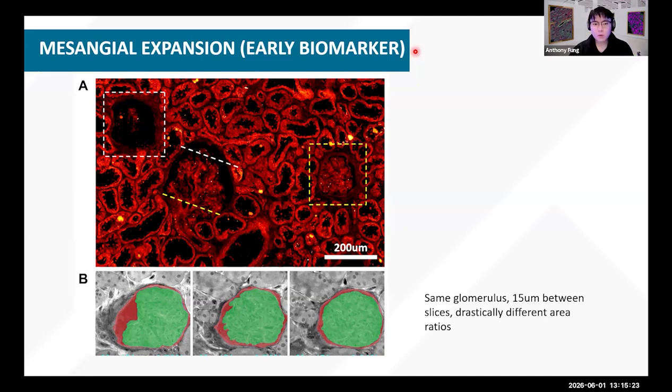But this can be done really quickly using modern image processing tools, like ImageJ, or any segmentation model that you're using. But what you'll notice is that the ratio that people are using differs very significantly with each consecutive section. So you have a very wide variation in any given 2D plane on your imaging slide.